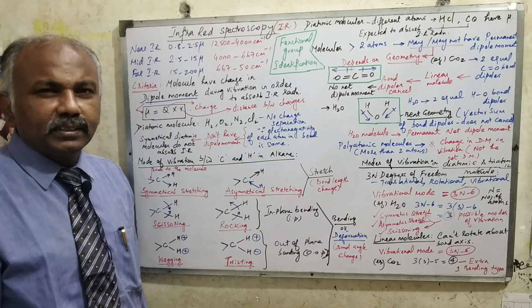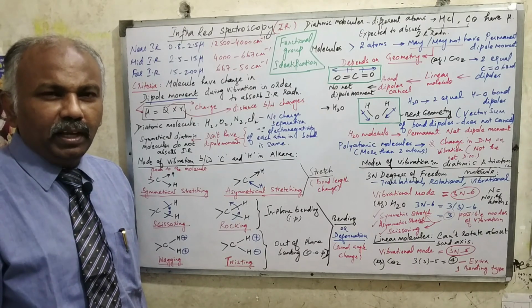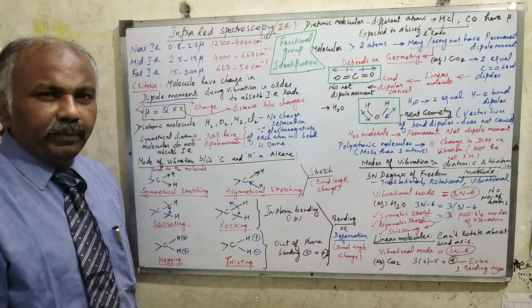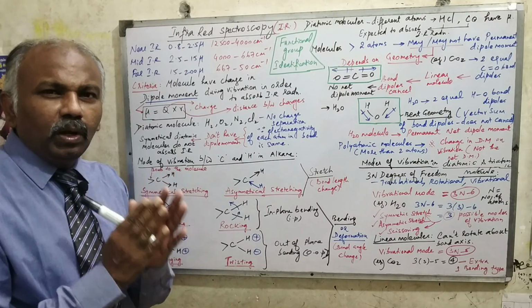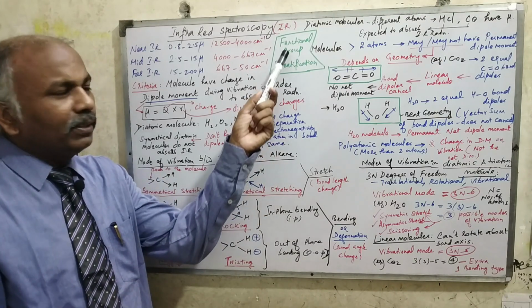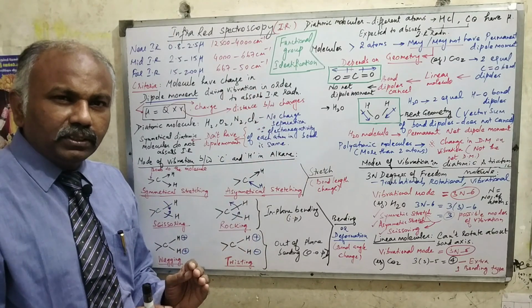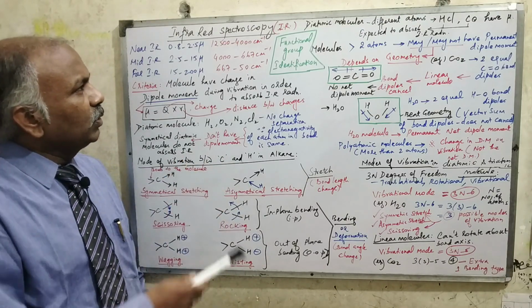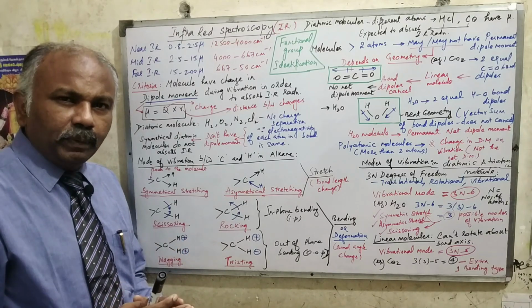Today I am going to discuss the topic of spectroscopy, particularly infrared spectroscopy and its principle. Right? So, what is infrared spectroscopy? Infrared spectroscopy has three divisions. What is the major role of infrared spectroscopy in drug analysis, particularly to identify the functional groups? Whenever you are going for any drug molecule, if you want to identify the functional groups, the ultimate method of analysis is infrared spectroscopy. So when we talk about infrared spectroscopy, there are three basic regions.